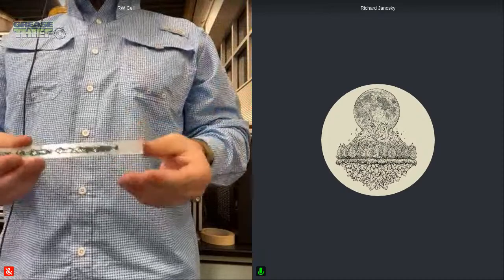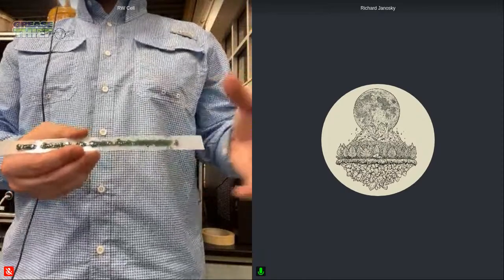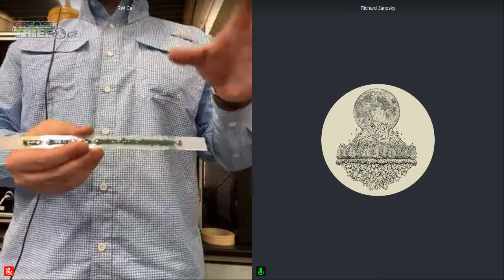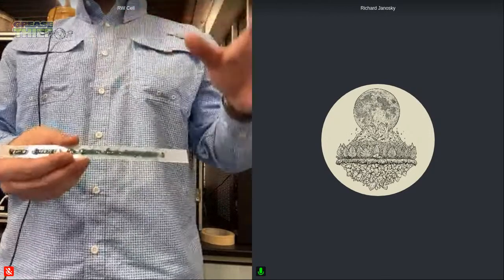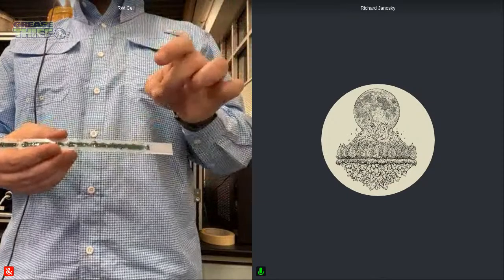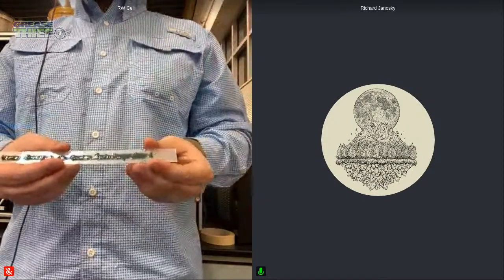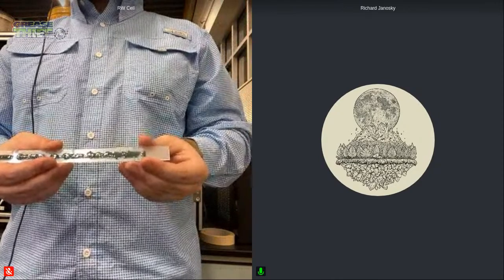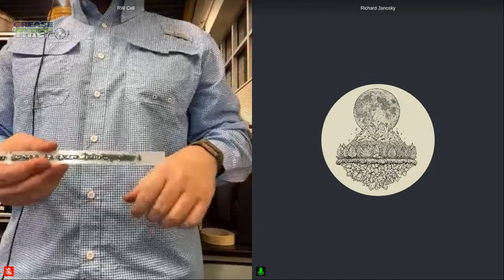And then it's the same way too for, as Rich mentioned, our antioxidant testing. So instead of having to smear the grease on and try and get a nice thin film around the outside of the vial, the greasy substrate can be curled up and slid right into the RULER vial. You add your solution, wait your time to allow the additives to be pulled out, and then run that analysis.